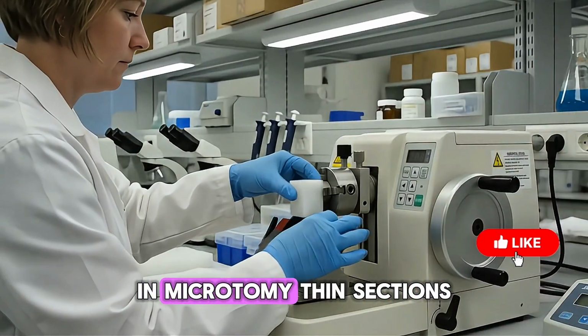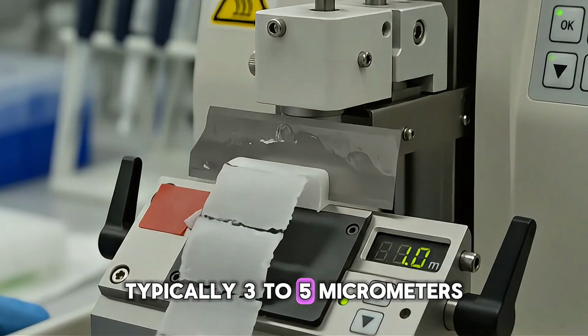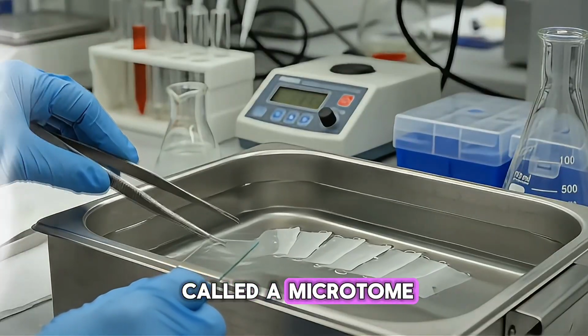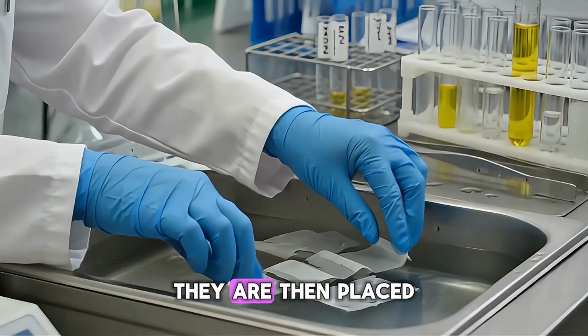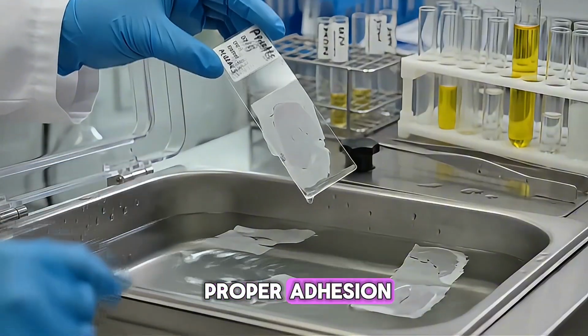In microtomy, thin sections are cut from the block, typically 3 to 5 micrometers, using a precision instrument called a microtome. The sections are floated on a warm water bath. They are then placed onto labeled glass slides and dried to ensure proper adhesion.